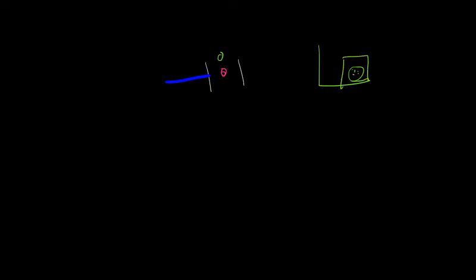We make a decision. You have to first define it, so we first do detection. We detect the cell, whether the cell is of my interest or not, and where the cell is coming from. The moment it is detected, what happens to the cell after the detection is done? The cell moves. The cell is not stagnant, it is flowing.